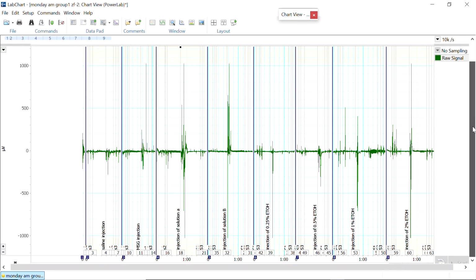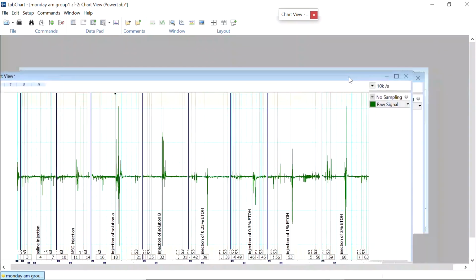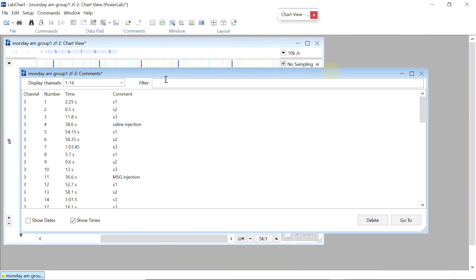If I move the bar down below, there's a piece of blue that shows up, and if I move, then the blue bar shows up. Now I can adjust the size. That is really annoying. I think that's a bug that the software needs to solve. It shouldn't be this hard.